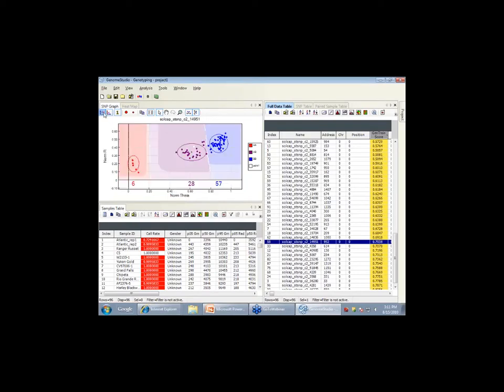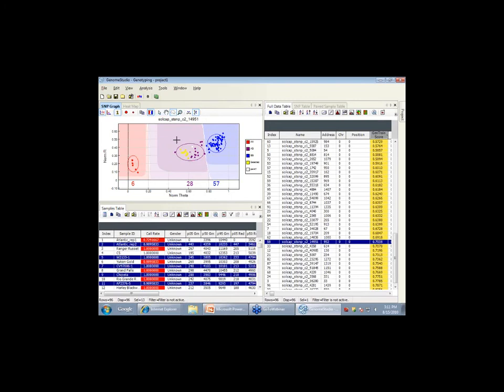You can highlight a number of data points. It's called lasso mode. You click this little lasso at the top, and you can highlight a whole bunch of data points in this area. Now those are highlighted as yellow, and you can define those as separate things.